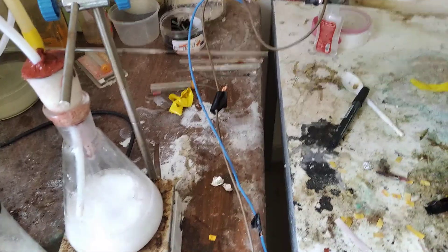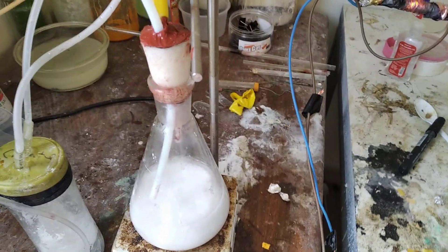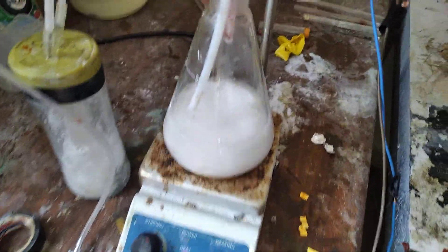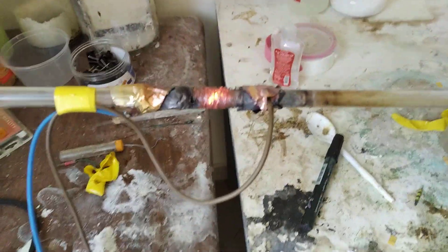You have your upstream process — that's all of your preparing your reagents. Like, we're producing ammonia here. We have air here from this thing. Then we're drying it here, and then we have our actual reaction chamber. Downstream, we have to clean everything up so that we ensure only the purest products.